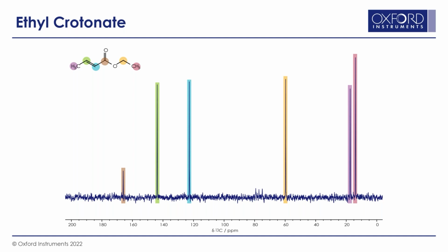This is not because coupling doesn't take place, but because carbon-13 NMR spectra are generally obtained proton decoupled, removing the carbon to proton splittings, greatly simplifying the spectrum and improving the signal-to-noise ratio. The second feature of carbon-13 spectra that you may notice is that despite each signal corresponding to a single carbon atom in the molecule, the peak intensities and integrated areas are not equal.